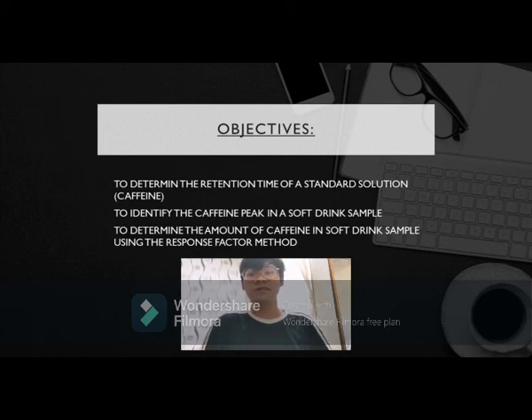The objective of this experiment is to determine the retention time of the standard solution, which is caffeine. Second is to identify the caffeine peak in a soft drink sample. And lastly, to determine the amount of caffeine in the soft drink sample using the response factor method.